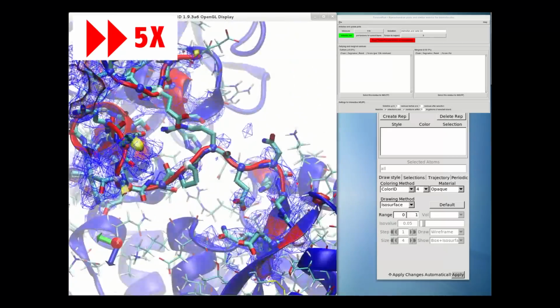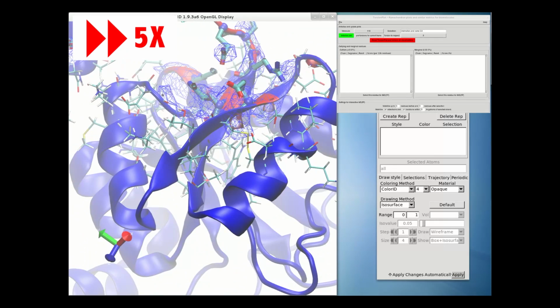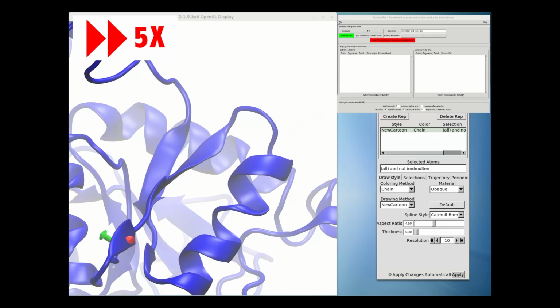The next 6 minutes or so shows more of the same tinkering, leading up to another stop to re-refine and regenerate new maps. Feel free to watch along if you like, but if you get bored, just skip ahead to the 15-minute mark.